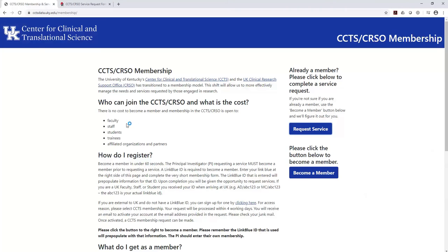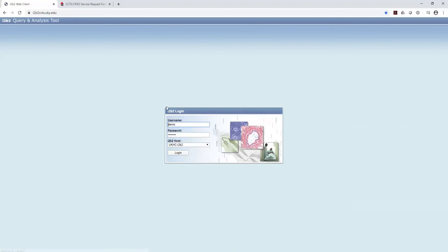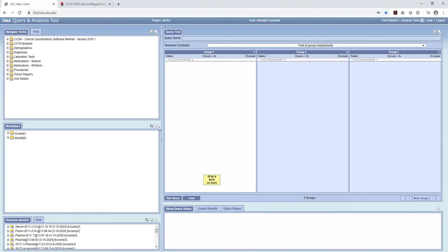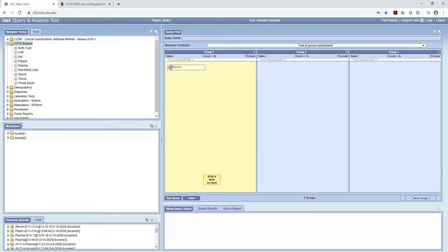Okay, so let's imagine we've done that. You now have an I2B2 account. I'm going to log in. Okay, and here is the I2B2 query page. So up here, there's a variety of different things. And one of them is labeled CCTS biobank. And so I can click on the plus there. And you can see here the different types of specimen that we have in the bank. So let's say I'm interested in plasma. I can take that plasma and I can drag it across here into group one.